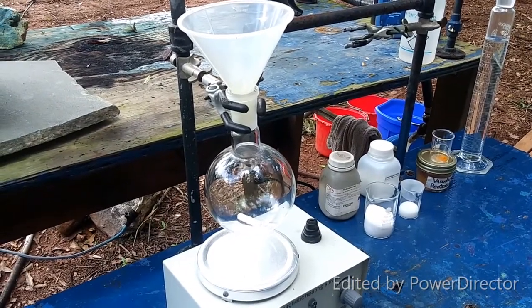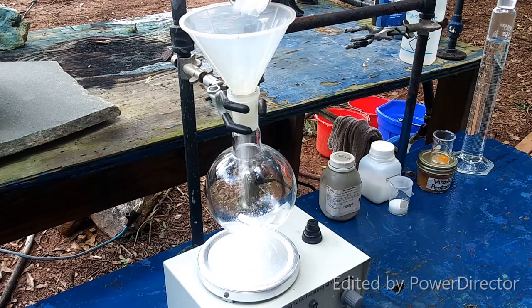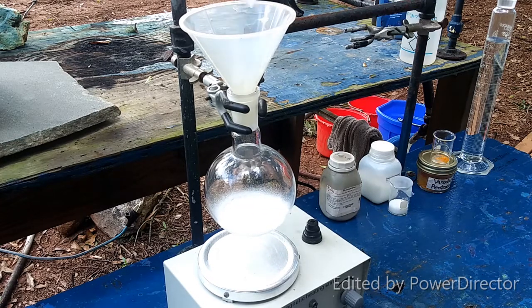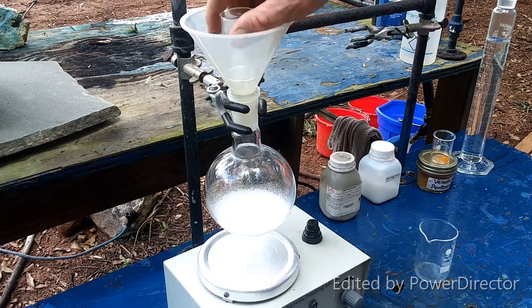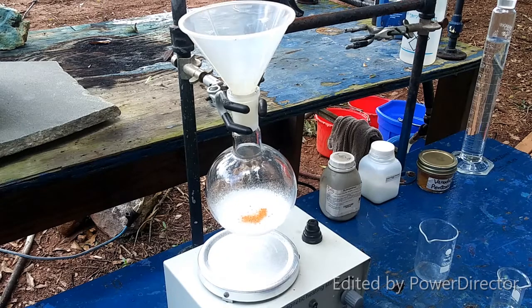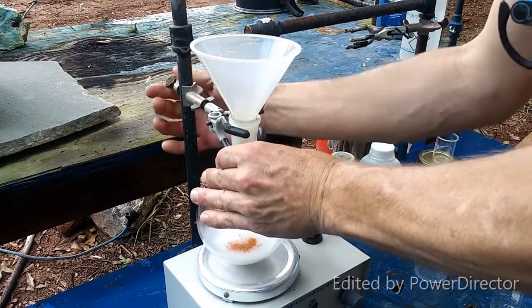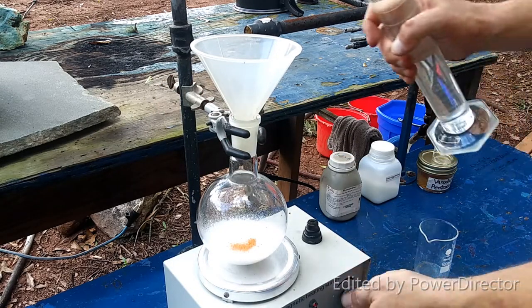First I'm going to add our hydroquinone — it does say it's going to need to be stirred vigorously, so keep that in mind. Here is our sodium chlorate. And the vanadium pentoxide. I'm going to move this down so I can get the stirring going right away — I don't want it turning into a solid lump.